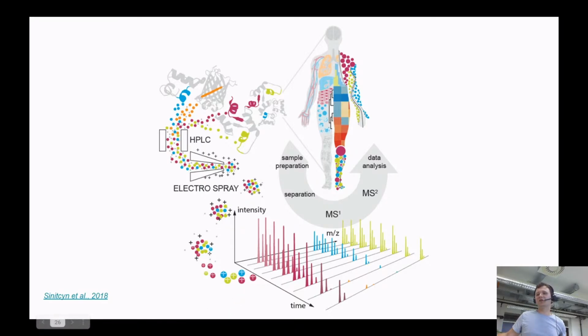We can for sure know the C and N termini. It's actually a question: when we degrade a protein with protease, how can we for sure know that this peptide is coming from the C terminus or N terminus? Probably we could do this if we would somehow modify the C terminus and N terminus of the initial native protein. But that's actually not what's happening. Usually this is an additional step which people don't do.